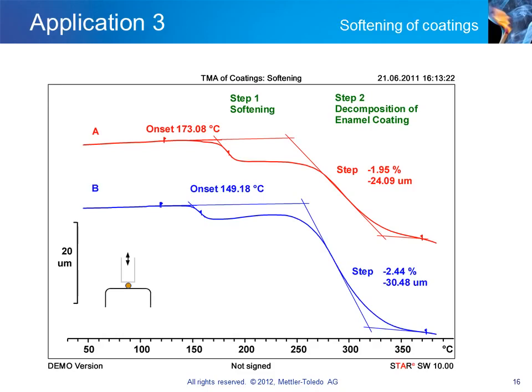The thickness of the coatings can also be estimated by adding the heights of the two steps together and dividing by 2 because both the lower and the upper layers contribute to the steps. The results show that the coatings are 12 to 15 microns thick.